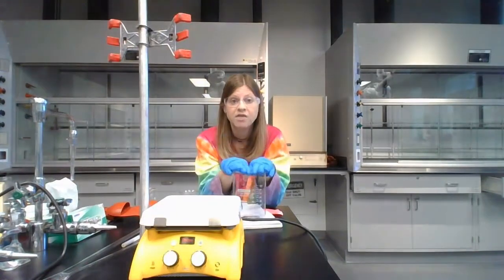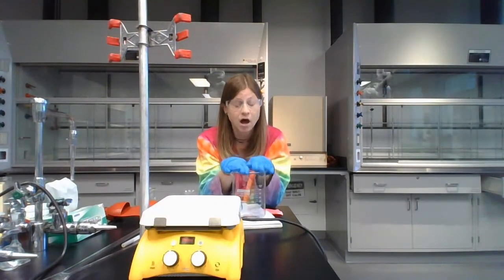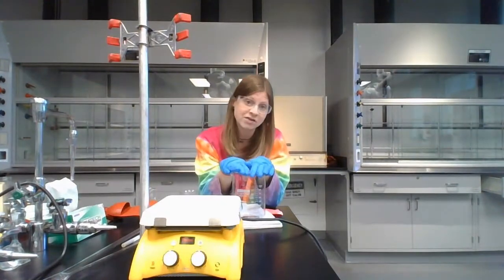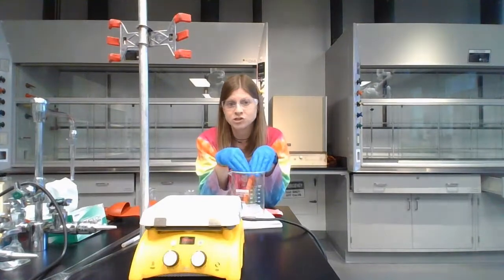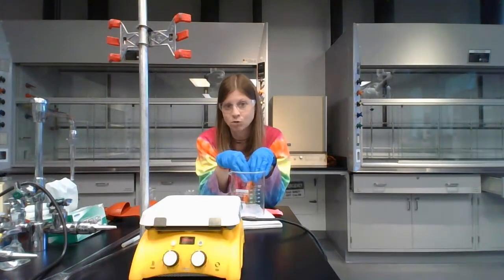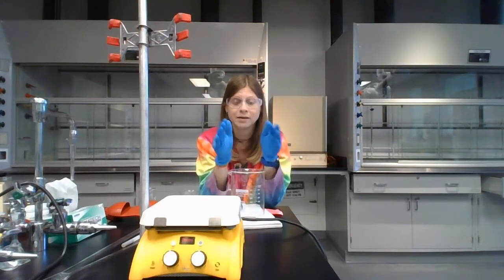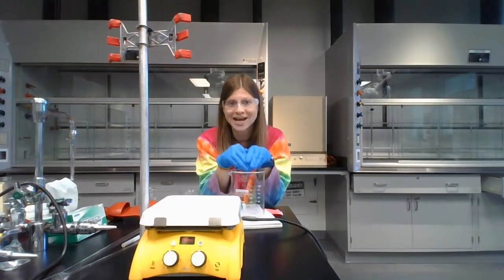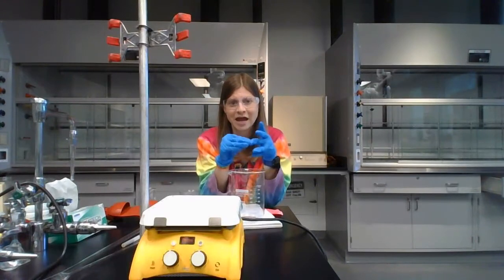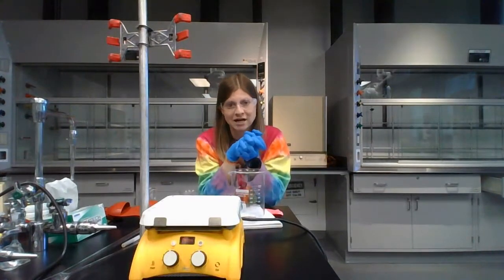At this point, the oxalic acid has reacted, or the oxalate has reacted, both from the oxalic acid and the sodium oxalate, and the potassium permanganate has reacted. So our mixtures beaker is not hazardous anymore. I'm not saying drink it, nope, but I'm saying it doesn't have to go in the waste container. So all we have to do at this point is neutralize this to a pH of 6, 7, 8, or 9, and then pour it down the drain.